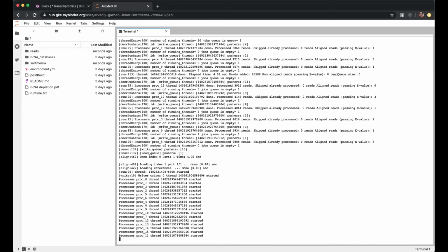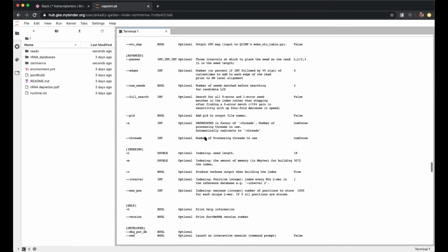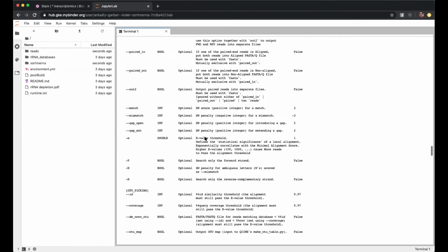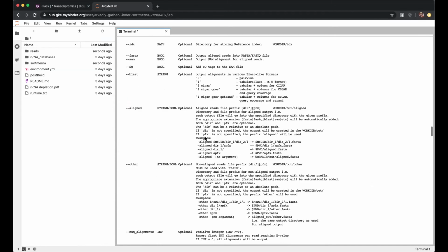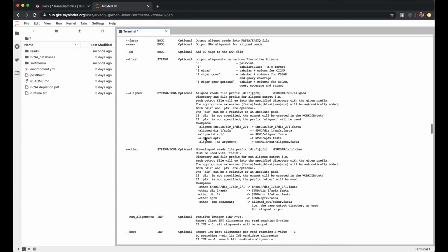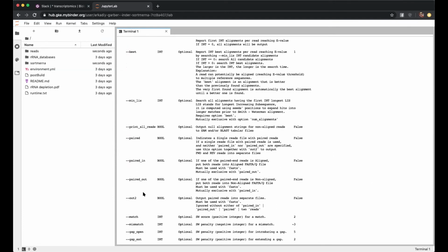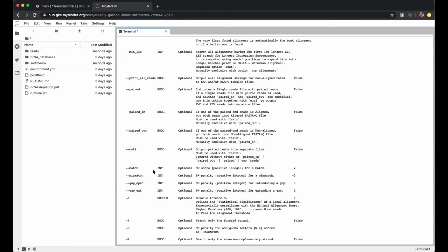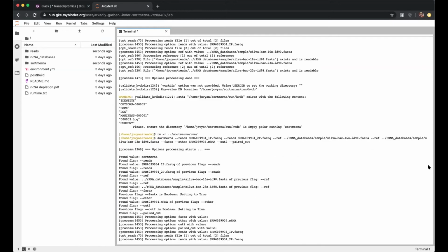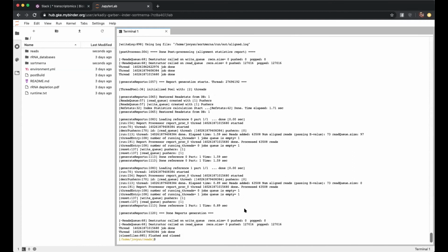So that's pretty much it. There's one more command that I do want to go over, and that's one that takes advantage of this OTU picking capability of SortMeRNA, which I think is pretty cool. I usually include it in my commands, but I've never used these OTU tables that SortMeRNA outputs. But I think it's pretty cool that it has this capability, so I kind of want to showcase it. All right, so finished.